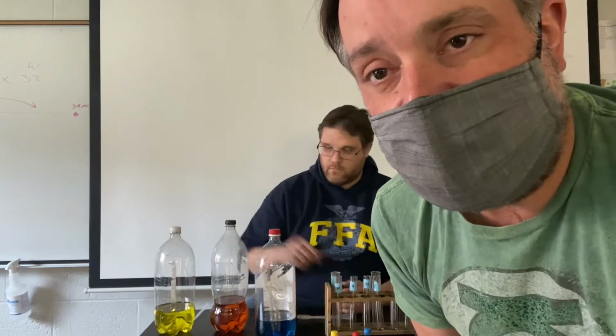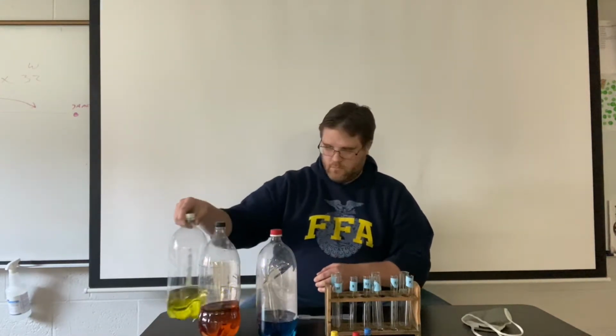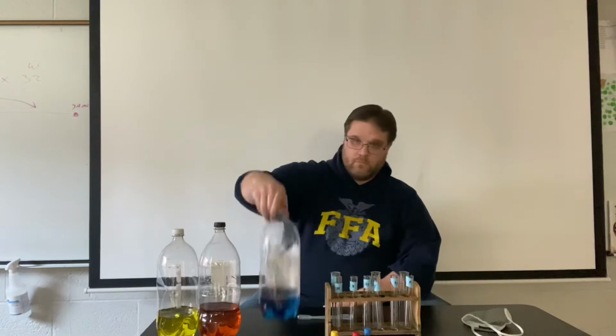We are going to be looking at some different chemicals being mixed, and we're going to end up making a rainbow here. So I'm going to go ahead and talk Mr. Whitty through this and step away so he can get this done safely, and then we'll go from there. All right, so first thing he's going to do is take the colors that are in the 2-liter bottles, and he's going to place them into the larger test tube. So we have yellow, we have red, and we have blue.